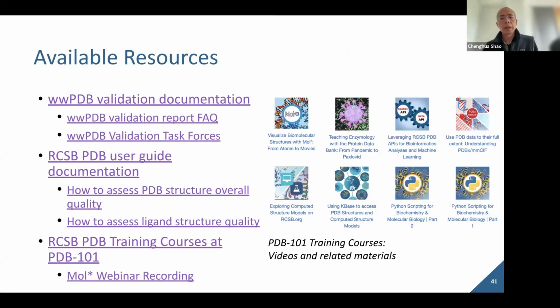Now, if we want to read more about the wwPDB validation and how to use RCSB PDB, here are the resources. And we also have the PDB-101 training courses that we ran in the past and will run in the future that you can listen to and learn from.